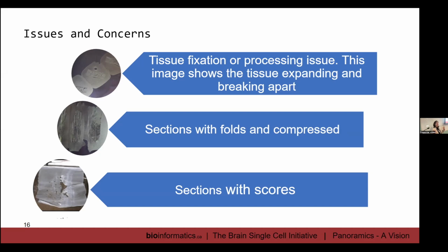Because if you have many blocks to do, which most people don't, usually it's only one or two for Visium HD because it is quite expensive, but you want to make sure it's bang on. And you've got to ensure the following as well. You've got to make sure that there's no rips, tears, or breaks in the tissue.